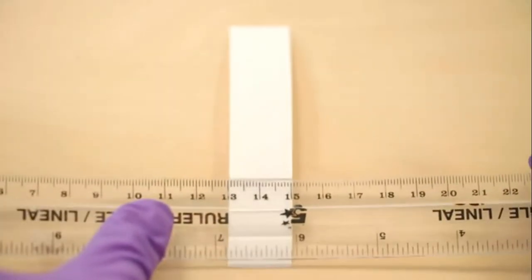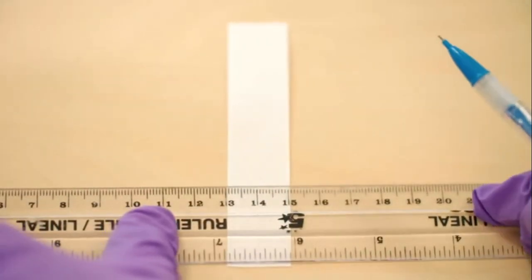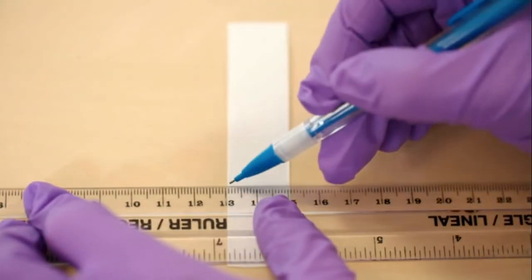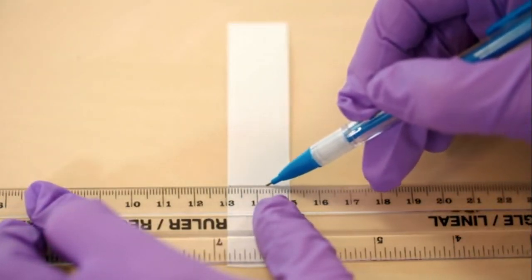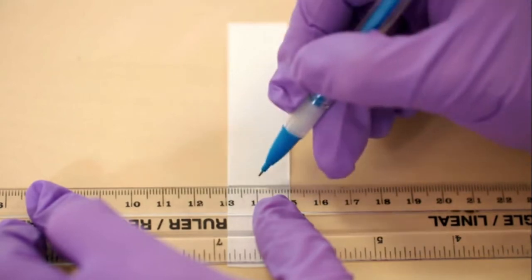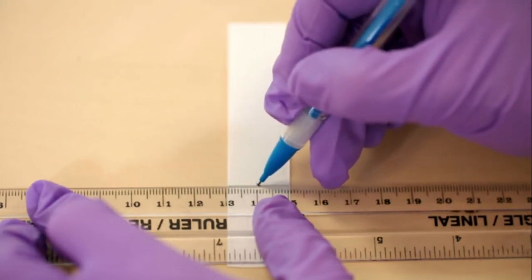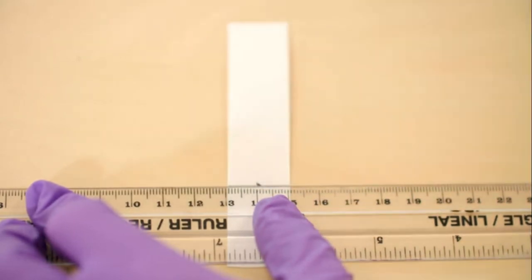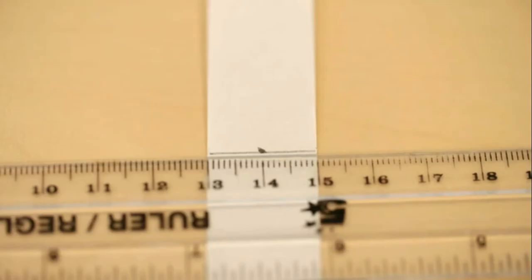A horizontal line is drawn using a ruler and a pencil about 3cm from the base of the paper strip. A single dot is added to the middle of the horizontal line. The chromatography paper should look like this before any leaf extract is added.